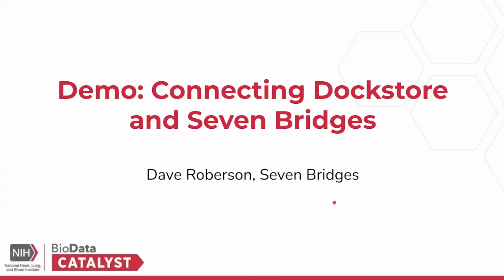So this is primarily a live demonstration. I do have a couple slides, but I'm going to be showing you Dockstore and Seven Bridges both live in my web browser. I want to show you some of the ways you can connect Dockstore and Seven Bridges. My name is Dave Roberson. I'm a community associate at Seven Bridges.